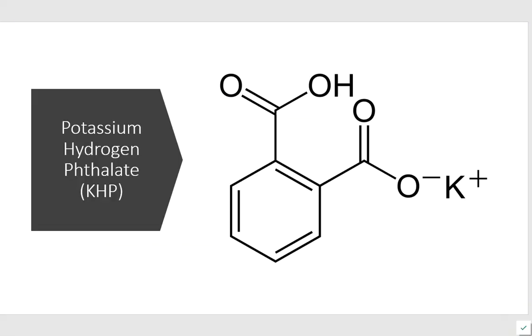So KHP, this is what it looks like. You do not have to memorize this structure. But KHP stands for potassium hydrogen phthalate. Okay, so potassium, there it is, right there. Hydrogen, oh, look, right there. Phthalate, well, it's probably the rest of the molecule.